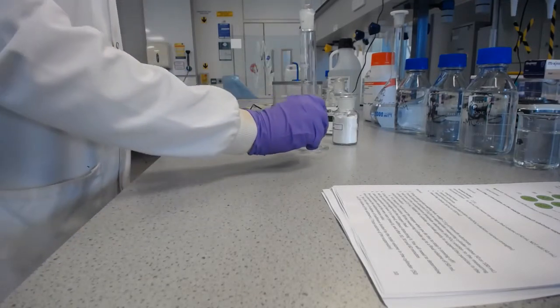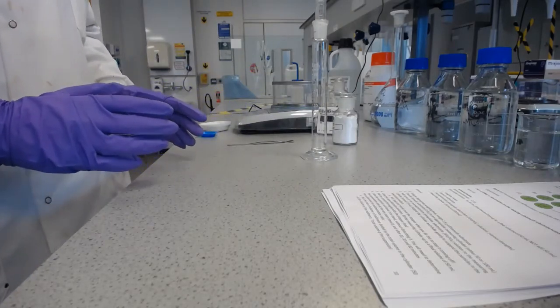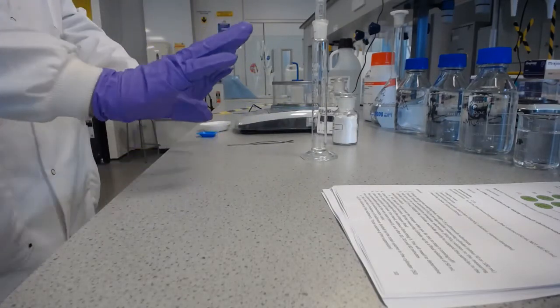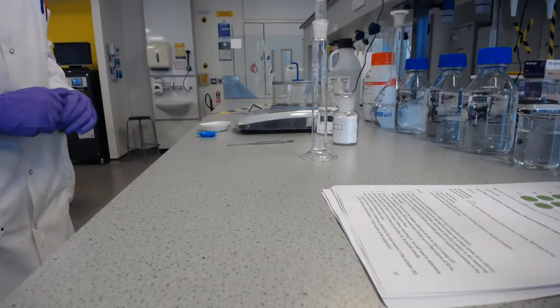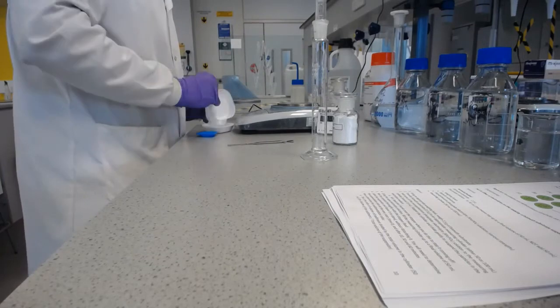So I'm going to get on with doing that. I'll just do one on camera so you can see it, and then I'll do all of the others, and then you'll be able to see them all in front of each other. So first of all, I need to weigh my bismuth.